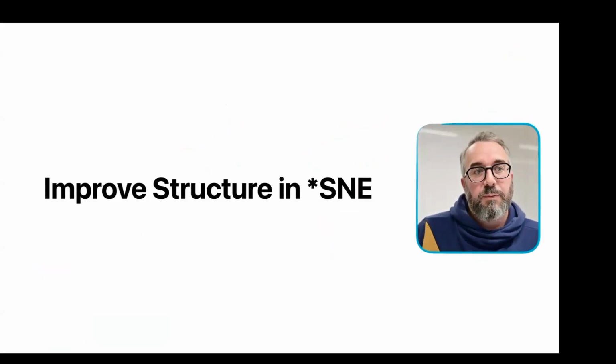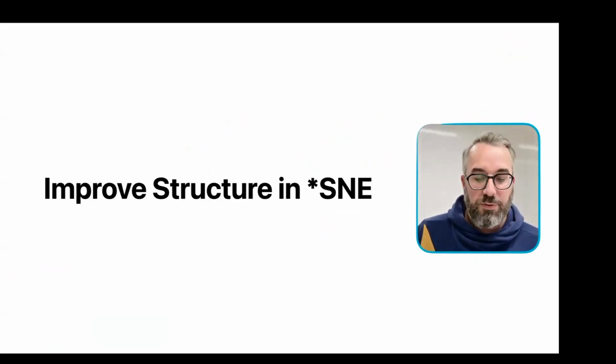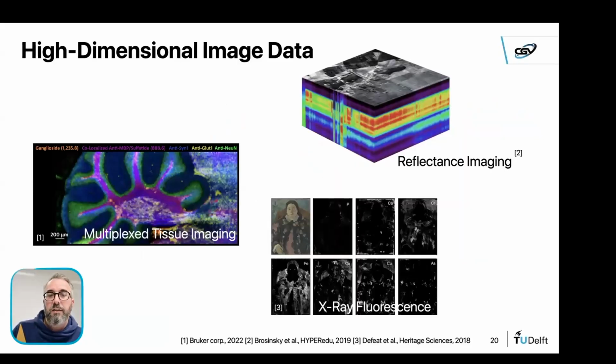So the second part that I want to focus on in this presentation is now improving the structure of the embeddings we get. And there are actually two axes I'm going to look at. The first one is looking at high dimensional or highly multiplexed image data.